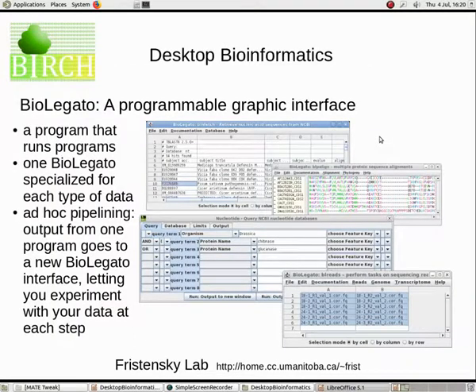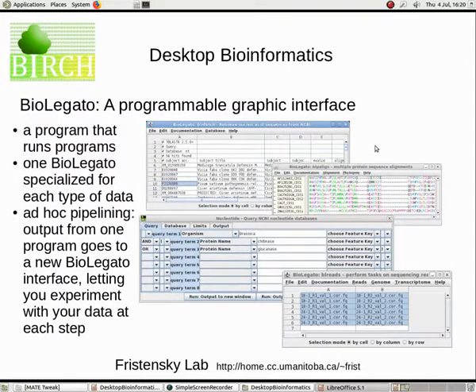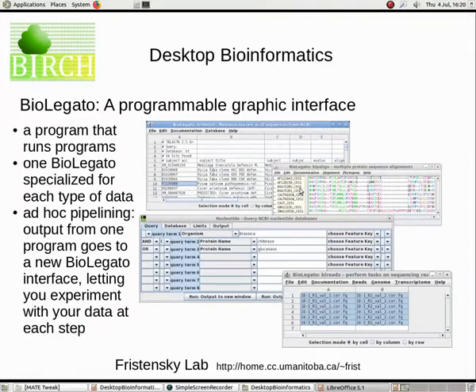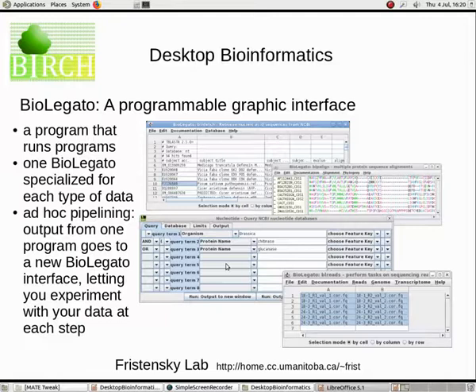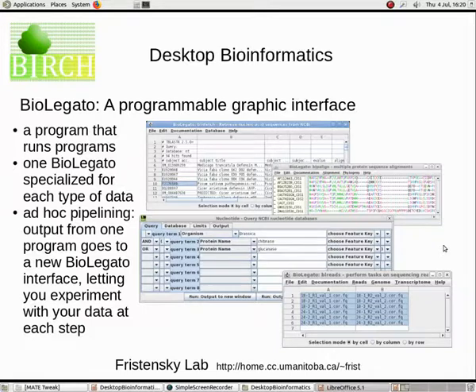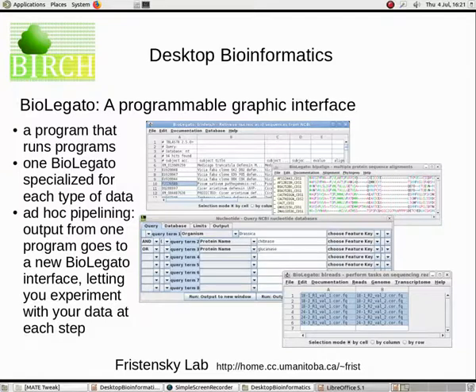Think of BioLegato as a program that runs other programs. There are many BioLegato interfaces, each specialized for running tasks on specific types of data. For example, here we see BioLegato interfaces for handling BLAST hits, multiple sequence alignments, doing keyword queries at NCBI, and for working with DNA sequencing reads for genome or transcriptome analysis. When we run a program from one BioLegato interface, the results are sent to a new BioLegato interface appropriate for working with the output of the previous step. This lets you discover new things from the results and then go on to the next step. We call this process ad hoc pipelining.